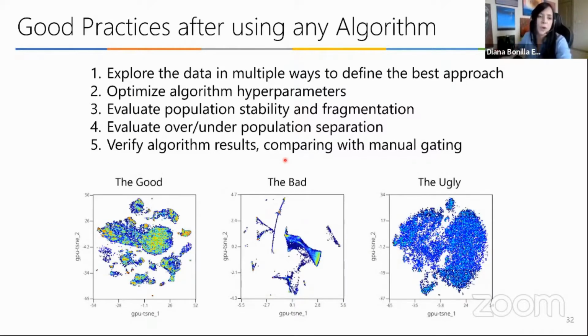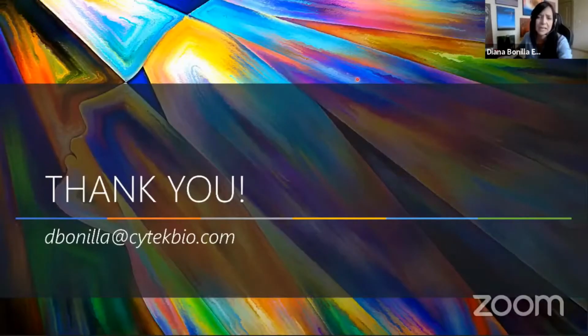And this is just to show you how the same data set can look differently, at least for this tool, when you change the parameters, and how important is the algorithm optimization. And I think that that's the end of my presentation.